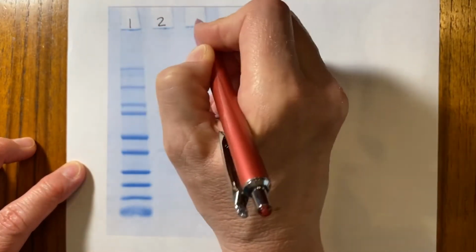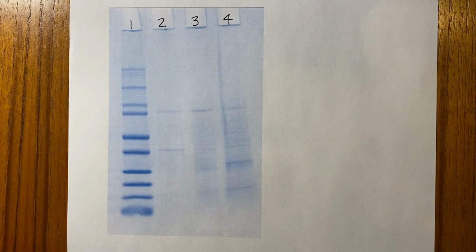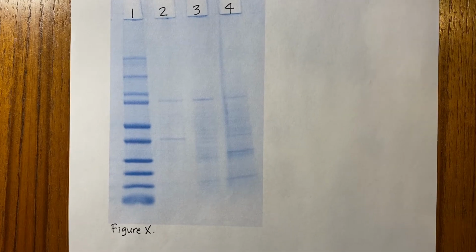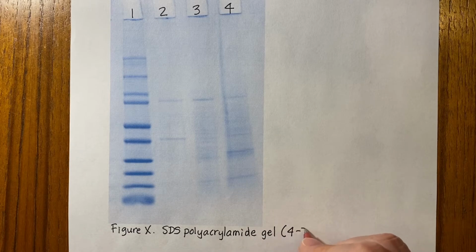Just use numbers 1, 2, 3, 4. And then you should identify what's in each lane in your figure legend that will be below your figure. So we'll just call this figure X, since I don't know what figure it'll actually be in your laboratory report. But you would give your figure a title, something like SDS polyacrylamide gel, and our gel was a 4 to 20% gel, so put that in your figure legend.